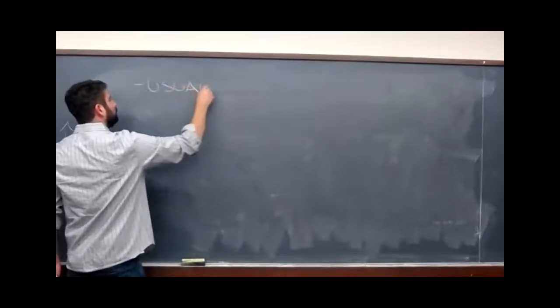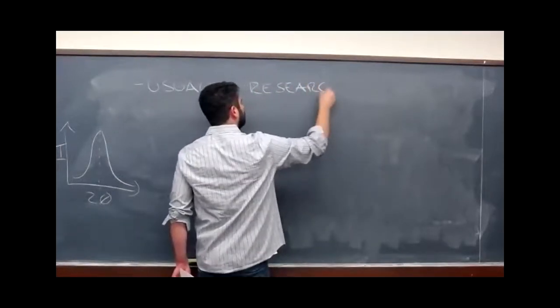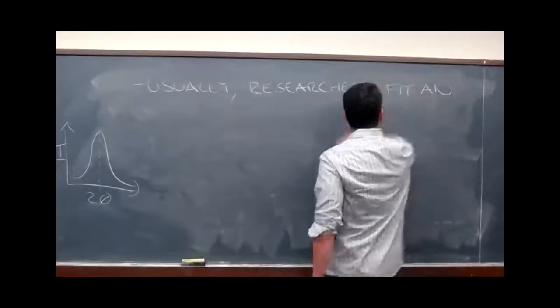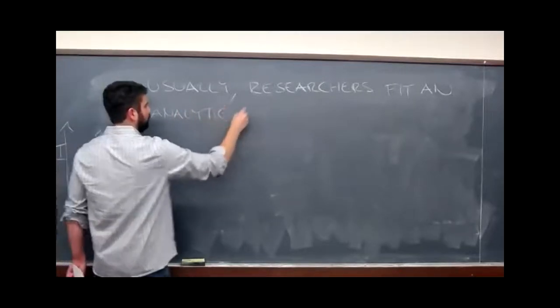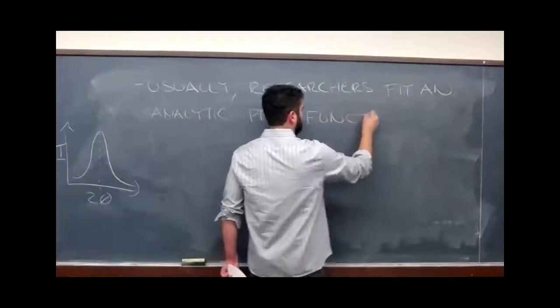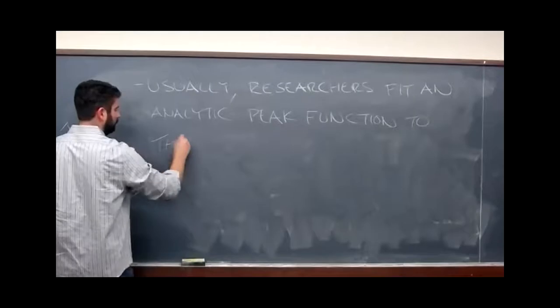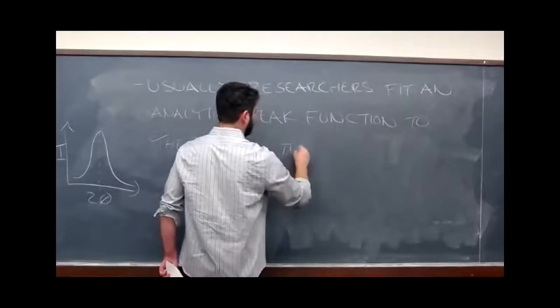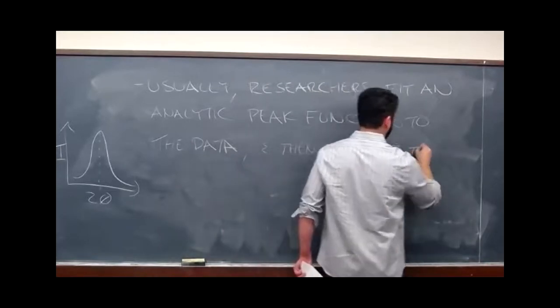So usually researchers fit an analytic peak function to the data, and then you can find those previous values of interest.